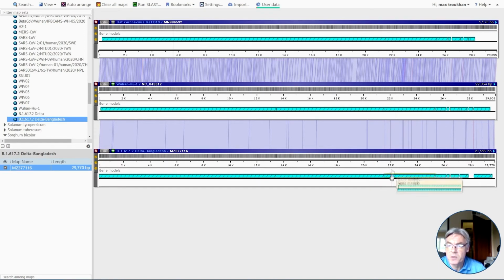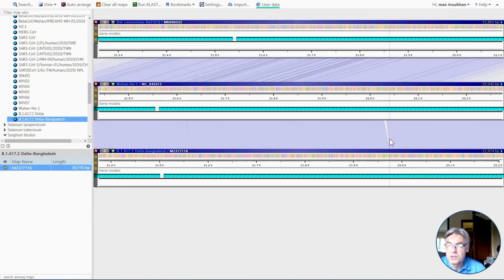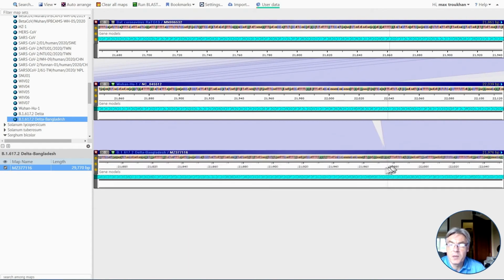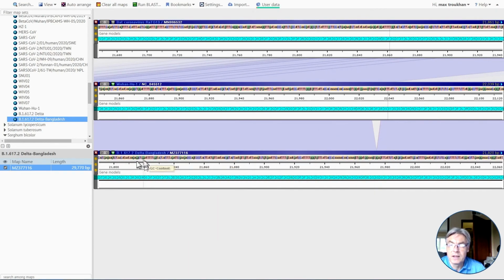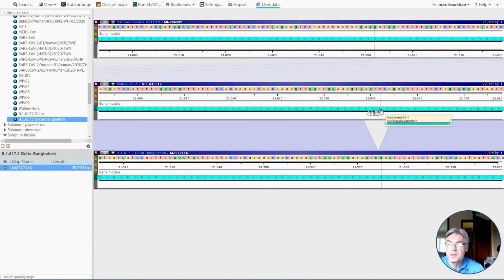This one is the spike protein, S protein. The red one means there is an insertion or deletion. So when we compare the Delta variant to Wuhan, and we know this one is more transmissible, this could be attributed to these differences. So we miss a few nucleotides that result in amino acid changes.